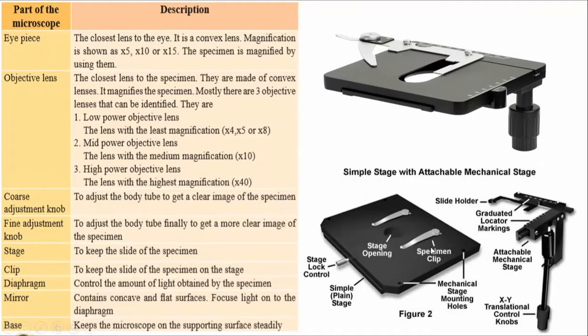Okay. So this is the stage where you place your glass slide, and here we have the clip where you clip the glass slide. Okay, and here are a few other additional parts in the stage. If you want, you can take a look at that as well. All right, so let's move on.